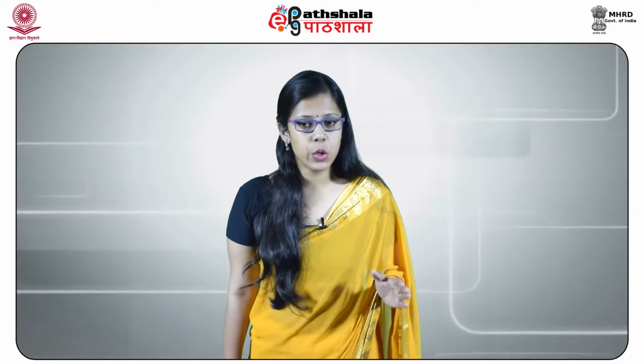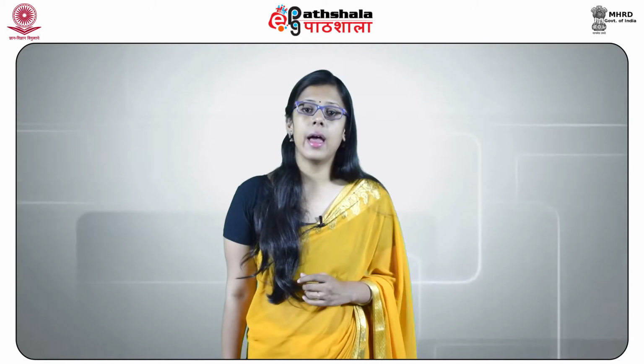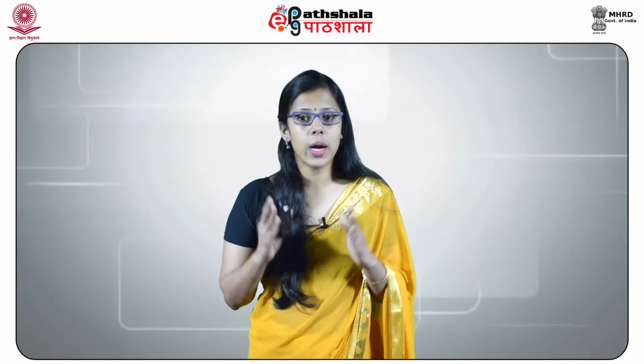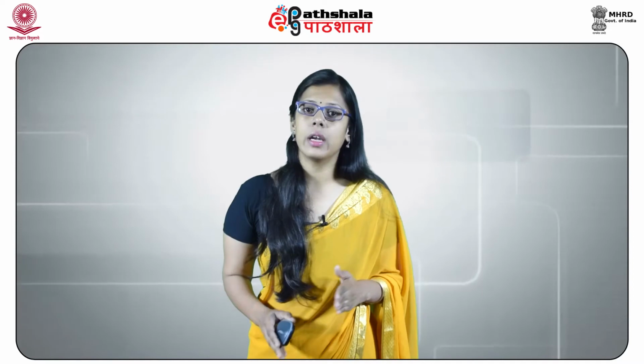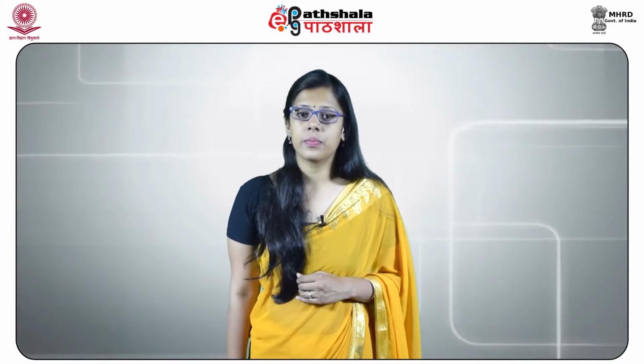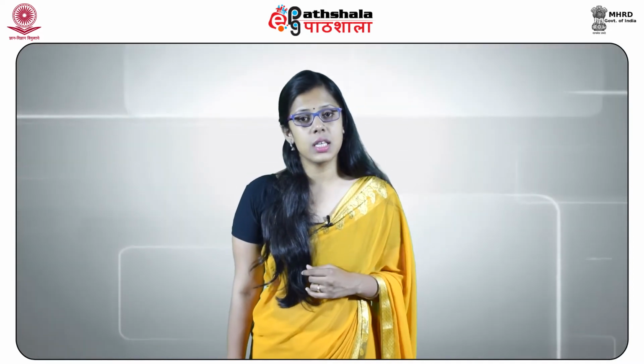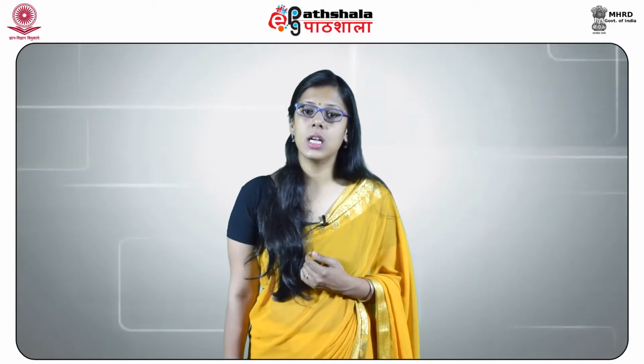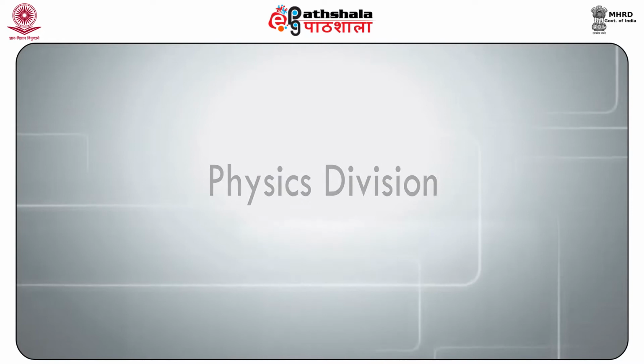The stereomicroscope should not be confused with a compound microscope equipped with a double eyepiece and binocular. In such a microscope, both eyes observe the same image with two eyepieces, serving to provide greater observing comfort. However, the image in such a microscope is no different from that obtained with a single monocular eyepiece.